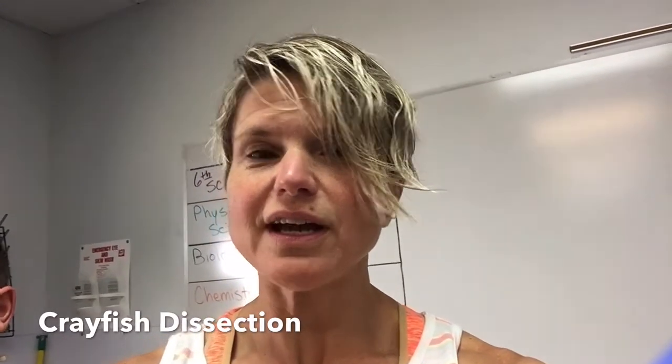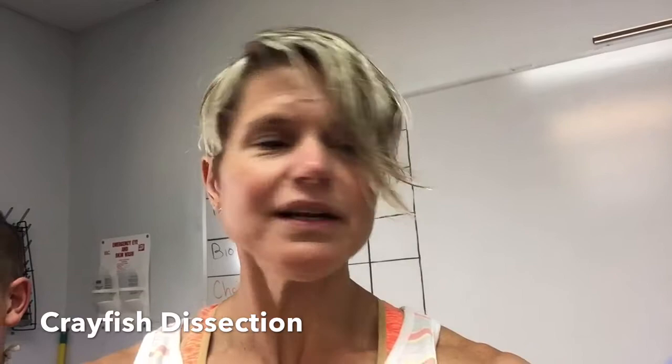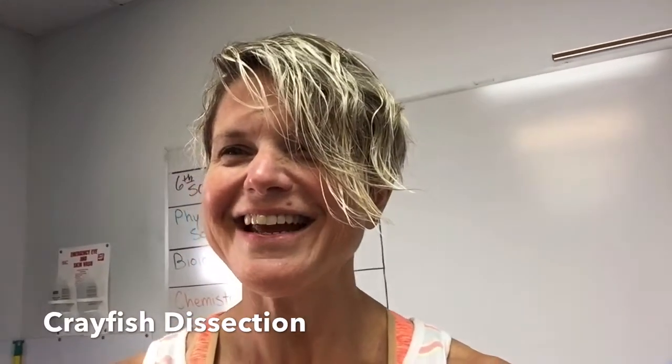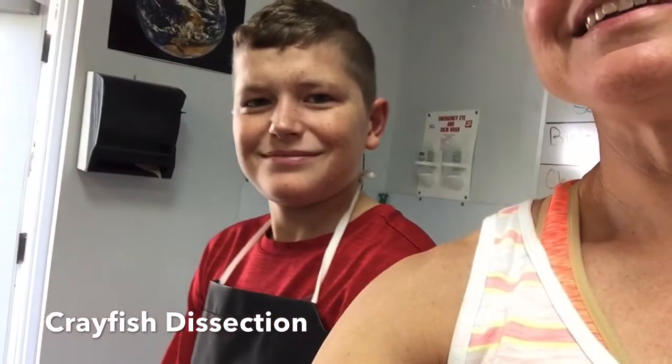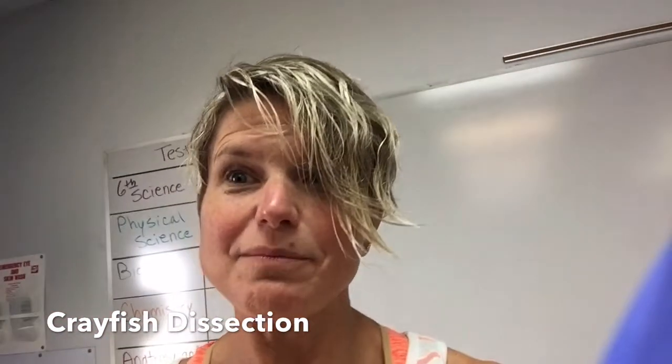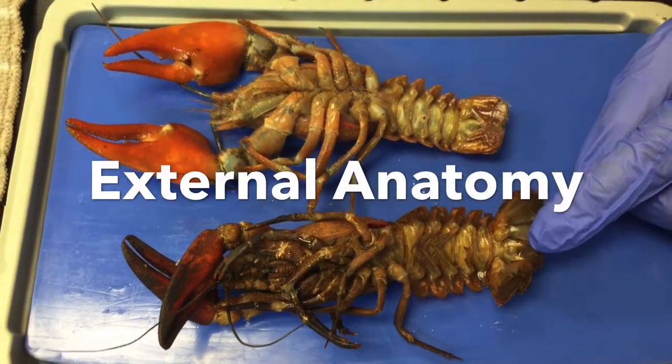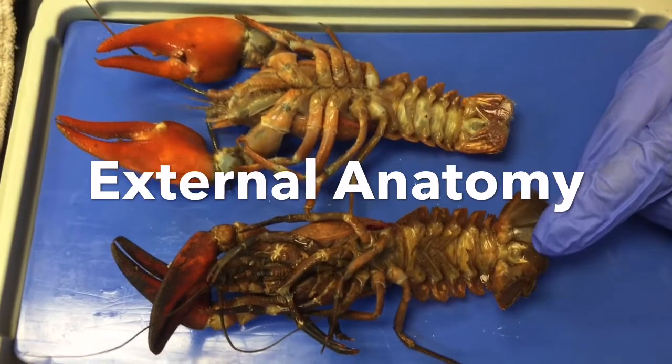Hey guys, we're going to do a crayfish dissection. I'd like you to have your lab books open to the lab for the crayfish dissection. And I've got Owen gets to dissect, and if we come back to school, I have a few more you can dissect. Okay, so what we have here is the ventral side, or the belly of the crayfish.